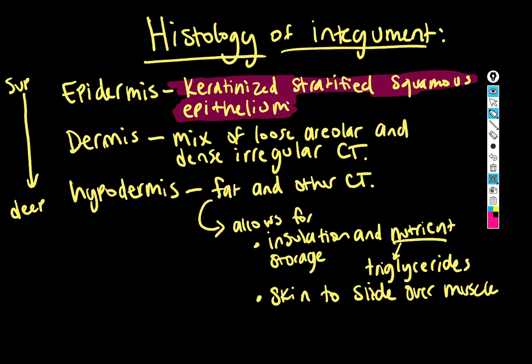So this is the first time that you're going to have practiced this skill. The reason we make you learn the tissue types is because you will figure out what part of the body you're looking at based on your knowledge of what tissue types it is made of and how those tissue types come together to form the tissue and or organ.